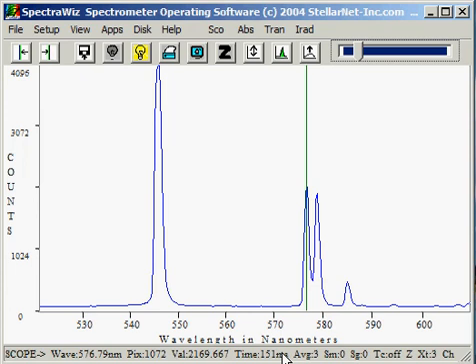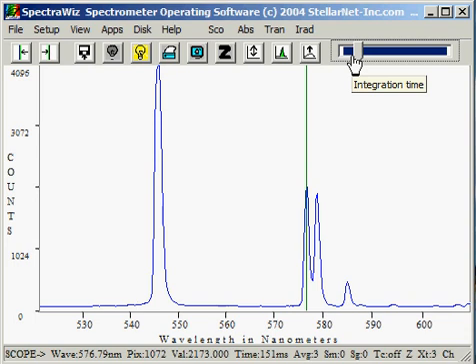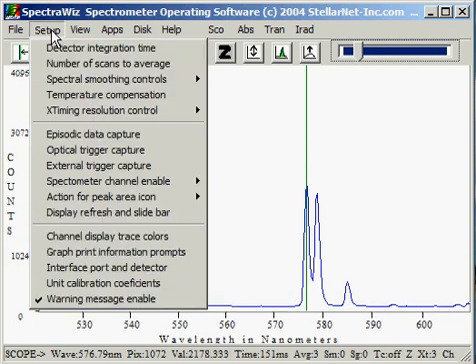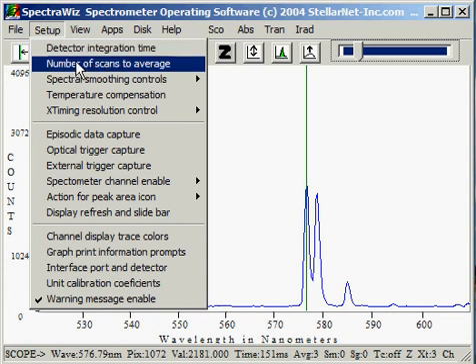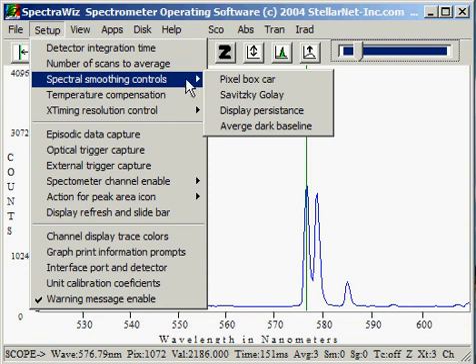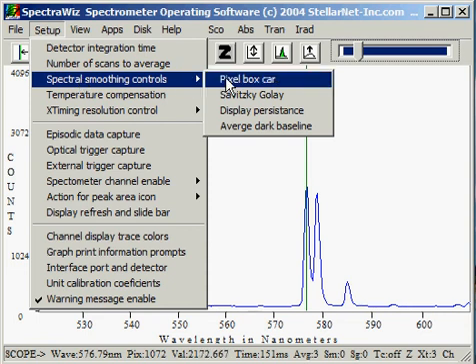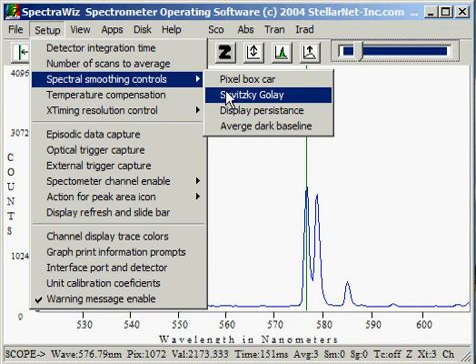Time is the detector integration time that is set by the slide bar, or more optionally on the setup menu. The next few items on the status panel are related to the current settings for detector integration time, number of scans to average, and spectral smoothing controls — whether we have pixel boxcar or Savitsky-Golay configured.